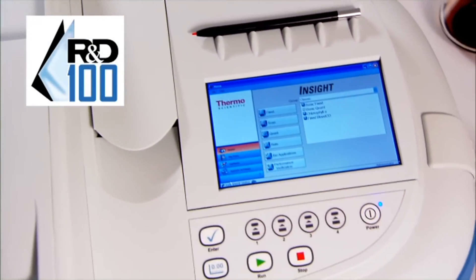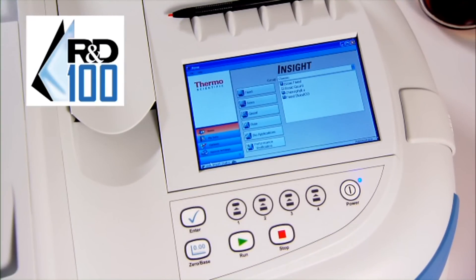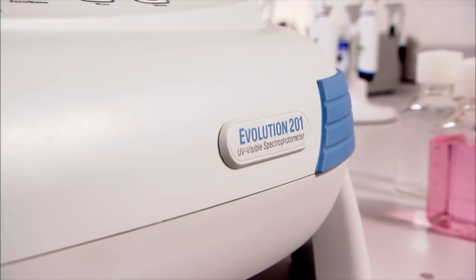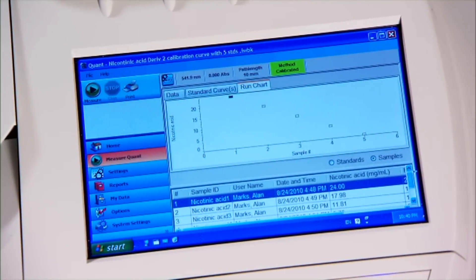Recognized by R&D Magazine as one of the most technologically significant products of 2011, the Thermo Scientific Evolution 200 Series UV Visible Spectrophotometer simplifies the sophisticated.